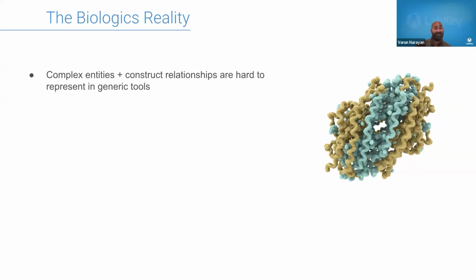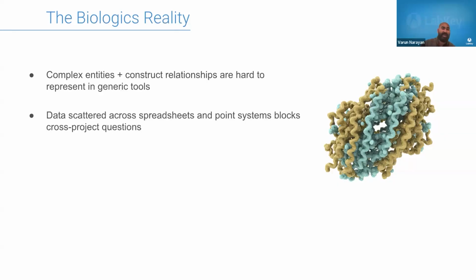And that can lead directly to the next problem, which is that having your data scattered across multiple spreadsheets and different systems blocks asking cross-project questions.